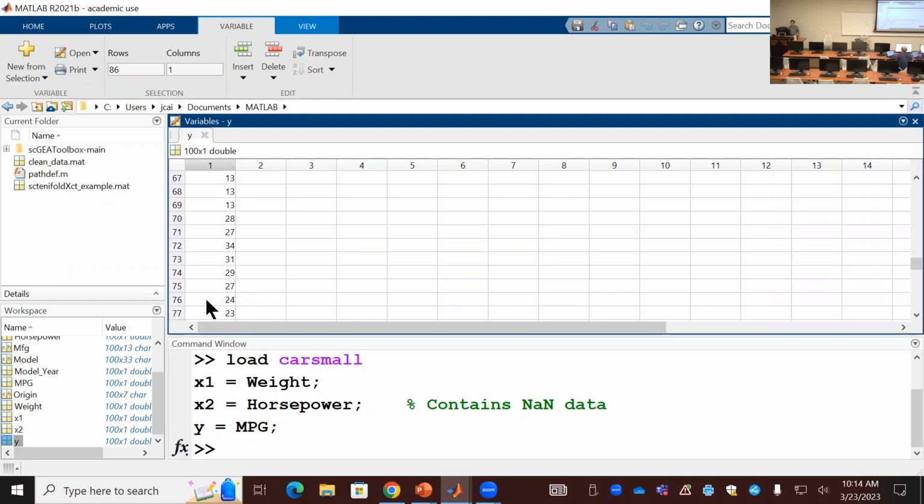That's really good. And we can see there are some missing values. Okay, the function will take care of these missing values. It will get rid of them. Some of the samples are invalid, no data. We will not use them.